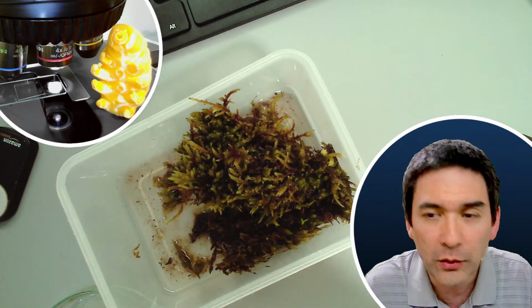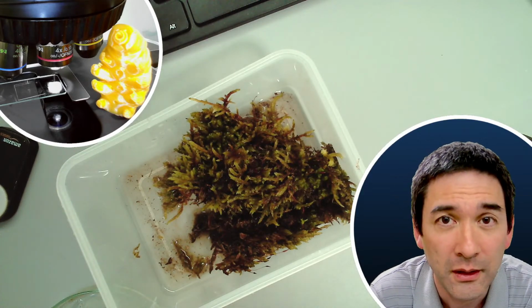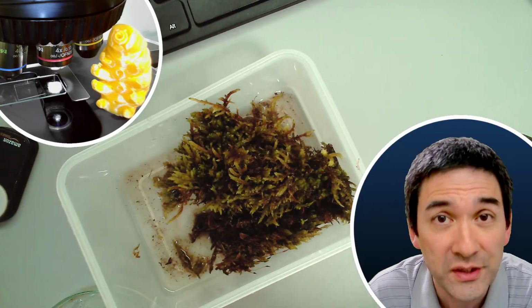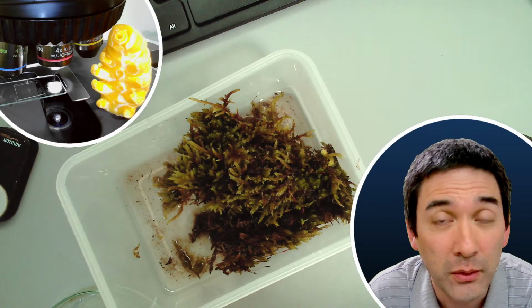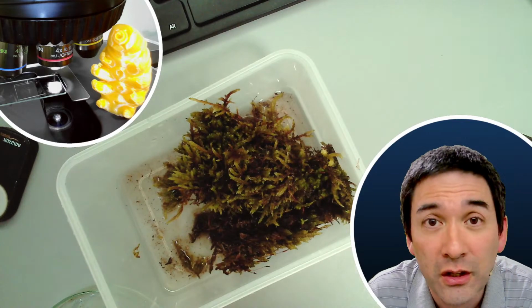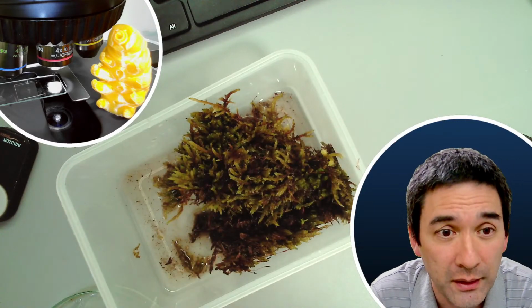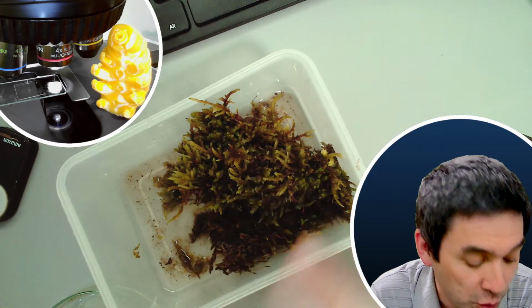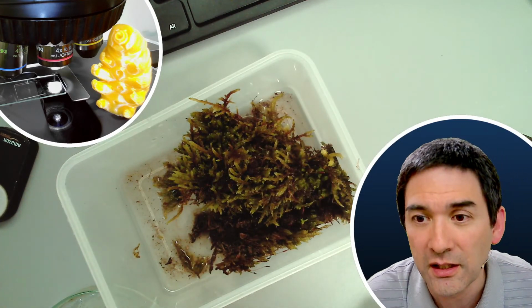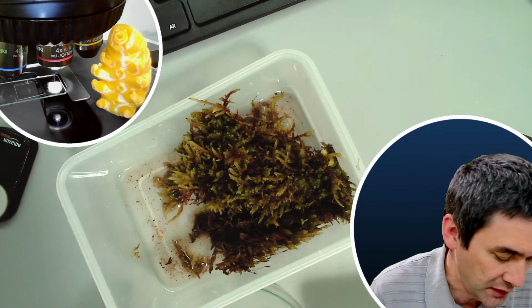So where did I collect the moss? It depends a little bit where you live, but where I live, if you go into a forest, for example, where it's a little bit moist on rocks, you can find them in many places. I collected this moss growing right outside my apartment. I simply grabbed it, and it was quite dry, and then I added some water 2 days ago, and I found tardigrades in here, but you have to be patient, as I just showed you. And now I'm going to show you what you can do.